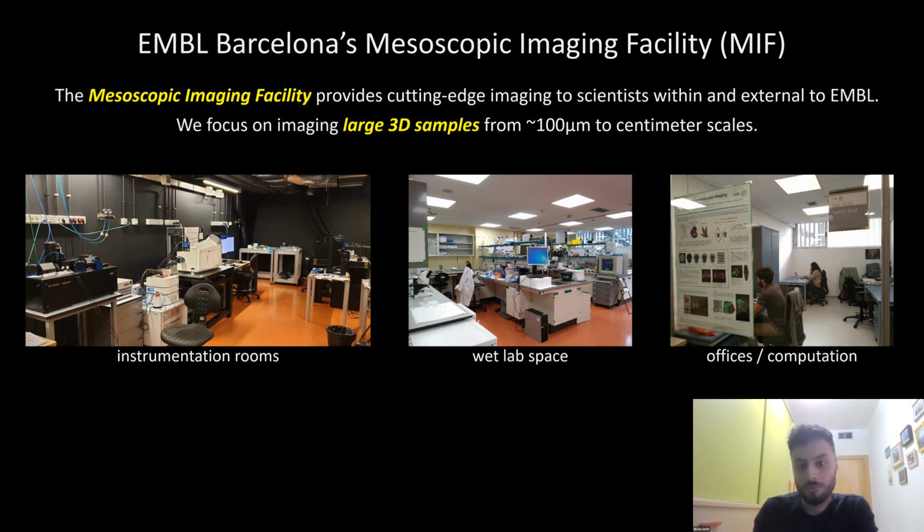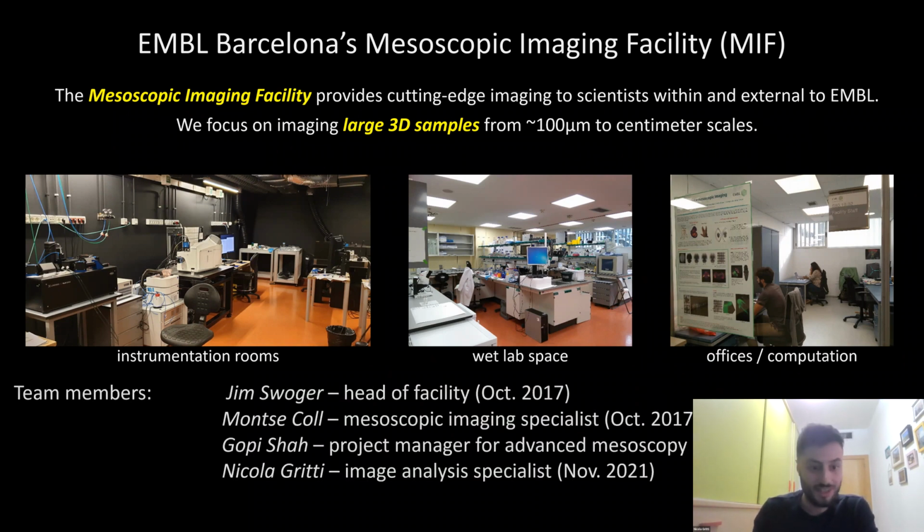The team is composed of Jim, the head of the facility, Montse, and Gopi. And as I introduced myself briefly, I was the last addition to the team in November of this year. So what does it mean to provide access to mesoscopic imaging for such a large range of scales, from micrometers to centimeters? The strategy of the MIF is to provide a number of instruments that are complementary to each other.